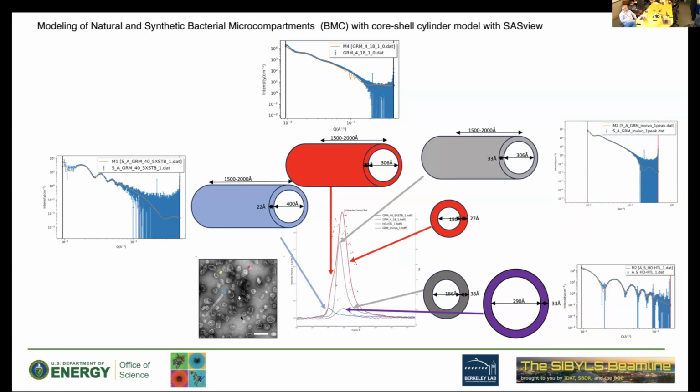First of all, is SEC-SAXS useful for this system? And also, can I use FoXS to compute? FoXS is just, you already have some model in your mind. You mentioned it's multi-chain or multi-domain, or it's completely unfolded or something like that. That's the question. So I would definitely try to just come up with some.